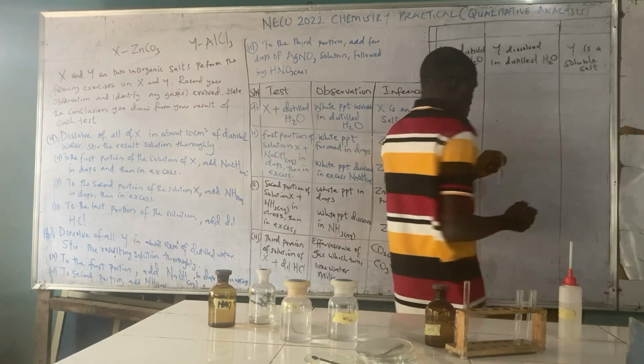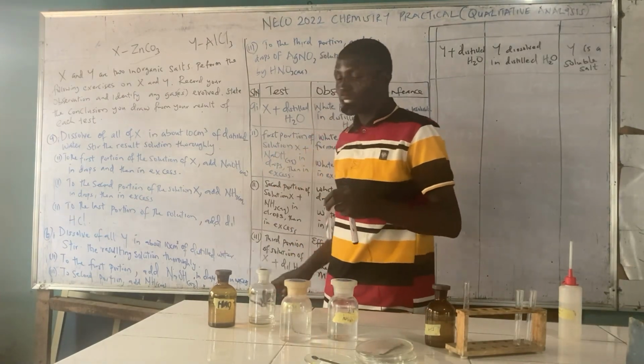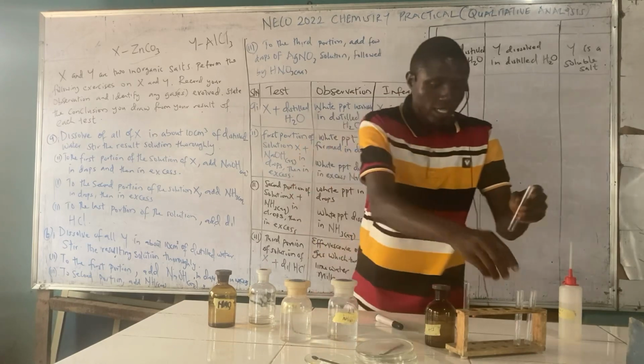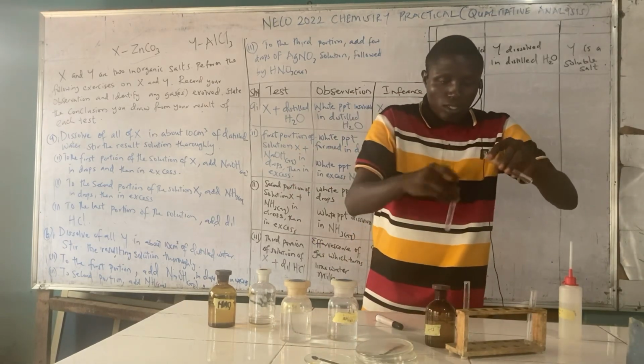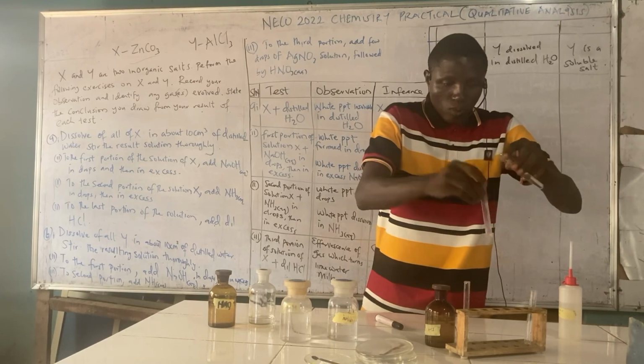Now, we are asked to divide this salt also into 3 portions. So let's divide into 3 portions: 1, 2, 3.